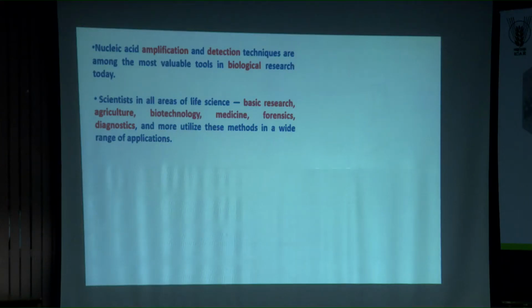PCRs are a kind of routine in most experiments. I'm sure in your PhD or MSc thesis, at some point in your experiments, you felt there is a need for PCR, right? So you cannot do away with the PCR technique in your thesis projects, right? That really signifies why PCR and, of course, the latest updated version, qPCR, are so important in science.